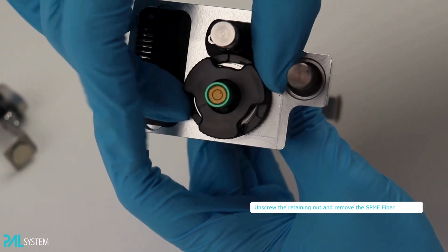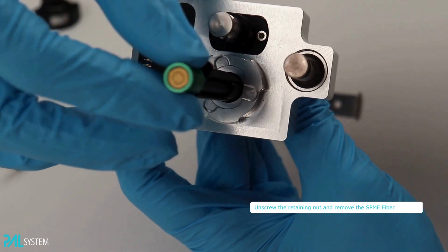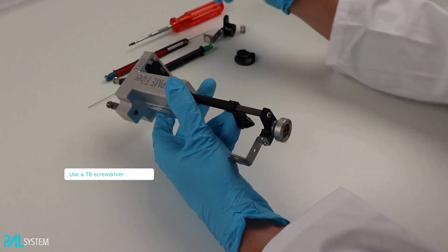Before changing the guide, remove any consumable that is still in the tool. Use the T8 screwdriver to unscrew the guide screw.